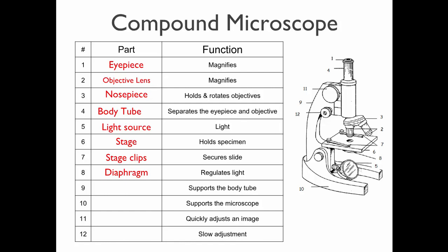When you're looking at a microscope, the amount of light that you're allowing in is really important in what you see. Sometimes you need it brighter. Sometimes you need it darker. And so on the microscopes underneath the stage, there's a little mechanical piece called the diaphragm. It opens up this hole larger or smaller to change how much light is going through and reaching your eye. Sometimes you look at these microscopes and it's blindingly bright. It means you need to close down the diaphragm so it's smaller and less light's getting through. Other times it's too dark and you open up the diaphragm to see more light.